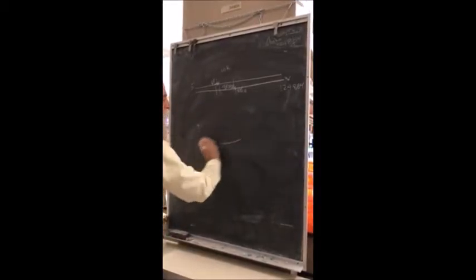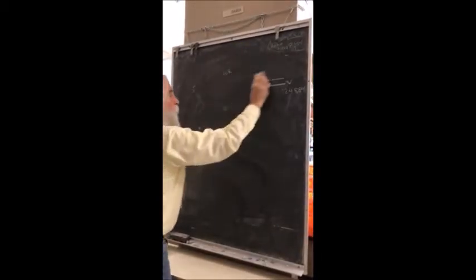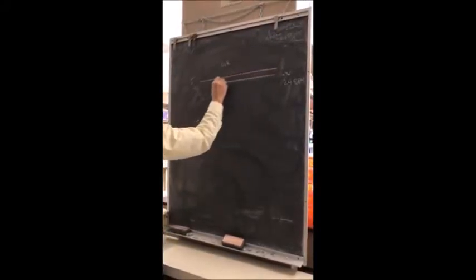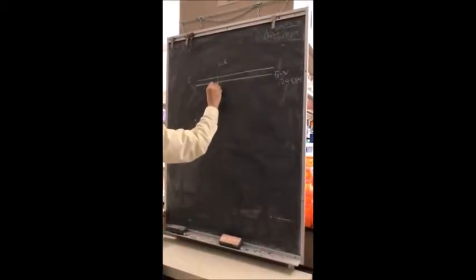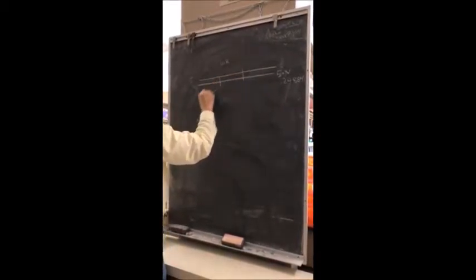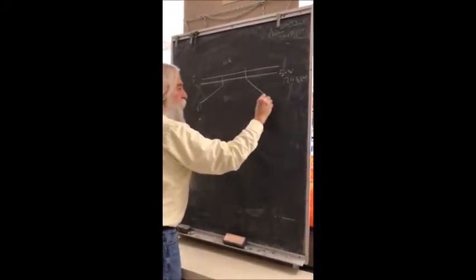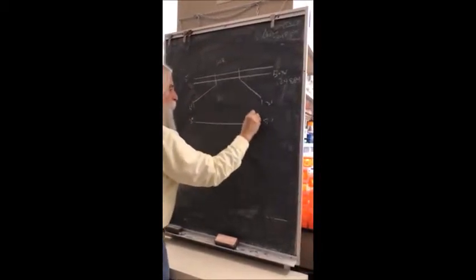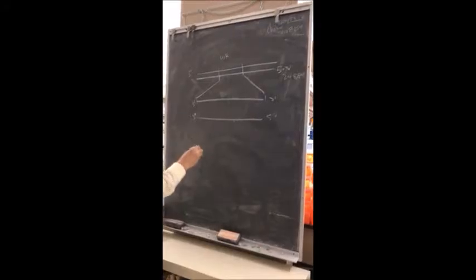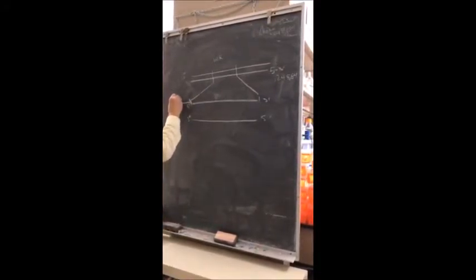So we're going to now change that protocol, and instead of amplifying out the whole fragment in one reaction, we're going to amplify it in 2 reactions. So the first thing that we did is we're just going to enlarge this area a little bit. We got a 5' end and a 3' end, and a 5' end and a 3' end. So the first thing that we did is we kept these primers that have the restriction enzyme sites on them.